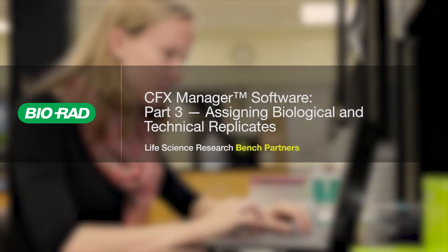Setting up biological and technical replicates greatly enhances your data analysis down the road. This video will show you how to set up these replicates on your experimental plate.